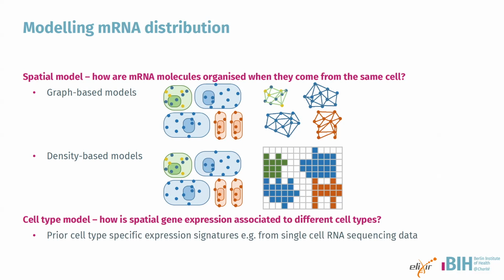And further downstream, you can actually take this data and feed it into some sort of classification algorithm, right? So these are essentially producing pseudocells. They're really not modeling any sort of cell landmark, but they may recapitulate what a cell might look like and allow you to analyze it. And similarly here, you get gene expression patterns in this lattice space where each pixel will have its own gene expression. And then you can classify those pixels and get a map of your gene expression patterns throughout your tissue.